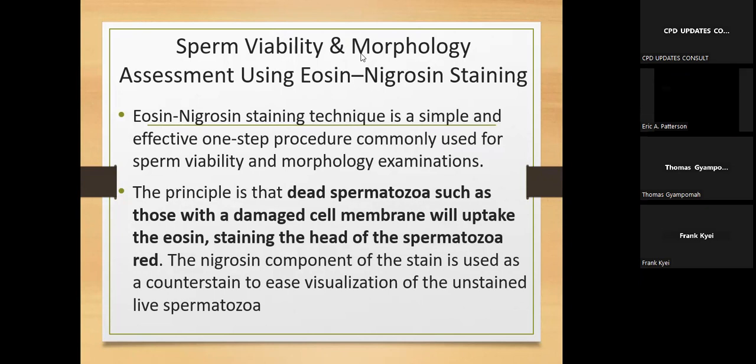Eric, it says in the background. By definition, staining is imparting color to something. So if you are not able to impart color to that something, and you're only staining the outside, then it's not a true definition of staining. Staining means imparting color to something. Before you can impart color to something, you must penetrate it and then express yourself there. So if you're not able to do that and you're only staining the outside, then that's negative staining. That is very great of you. And a typical example is the use of India ink in Cryptococcus staining, those of you in microbiology.